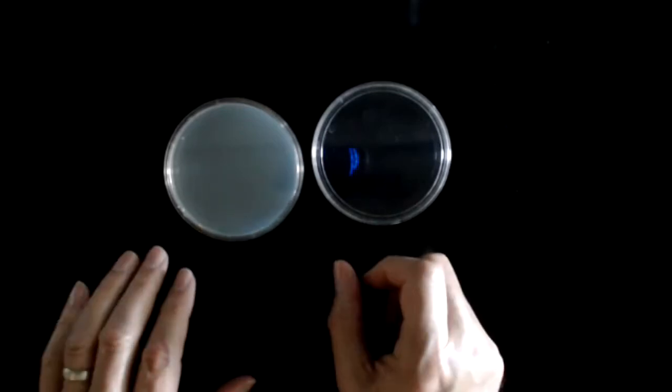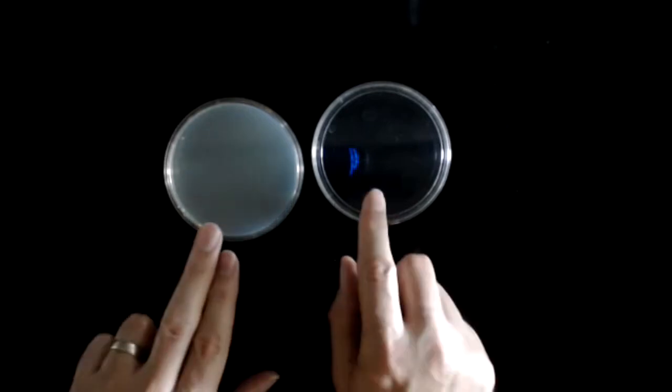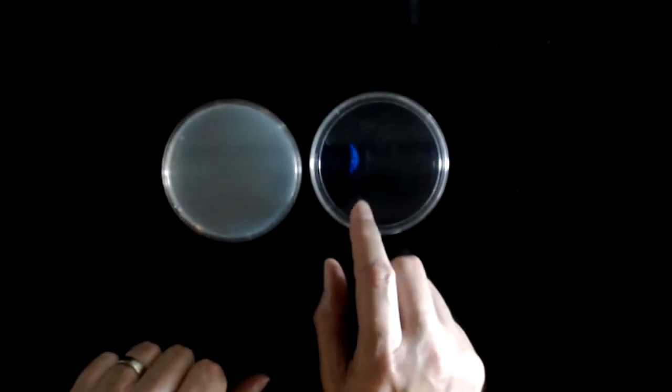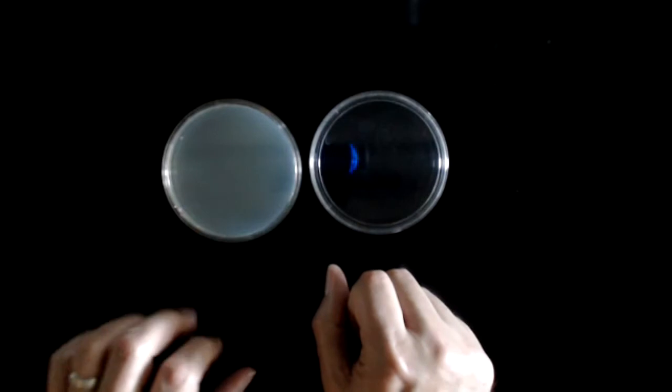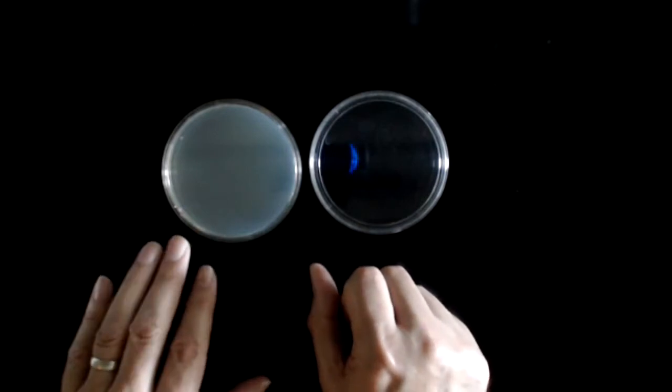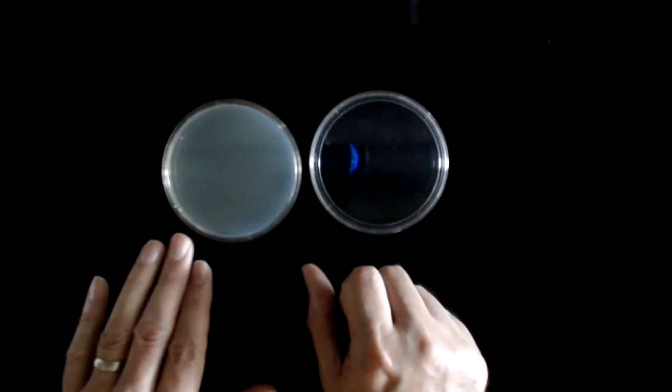Today we're doing module number 1, which deals with the ubiquity of microorganisms. Two important words there, ubiquity and microorganisms. Microorganisms, of course, are life forms that are difficult, if not impossible, to examine without some sort of magnification.